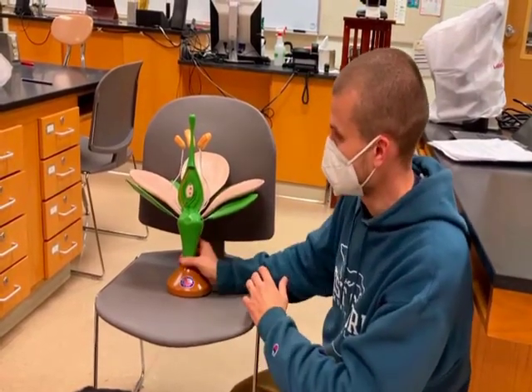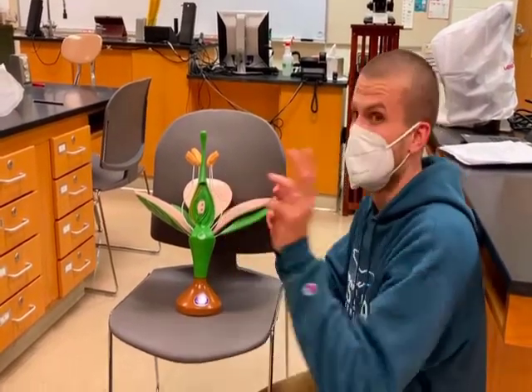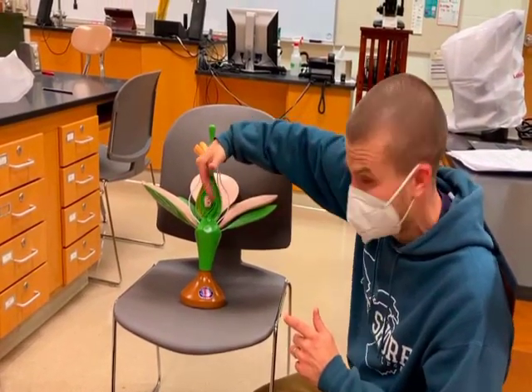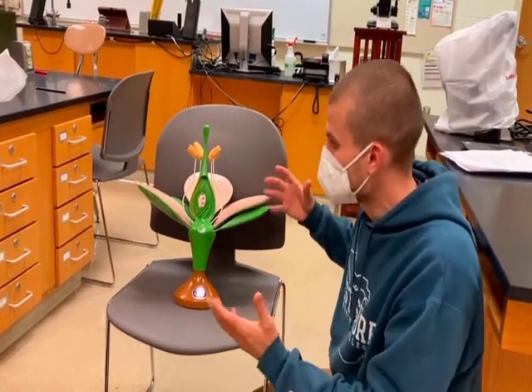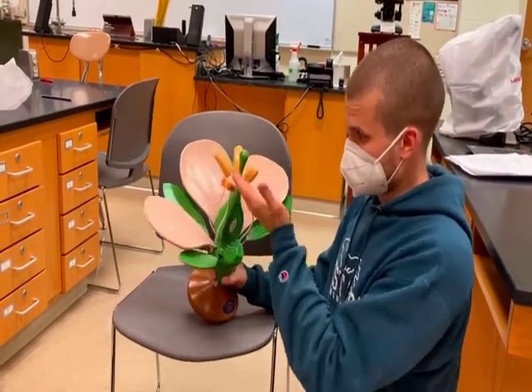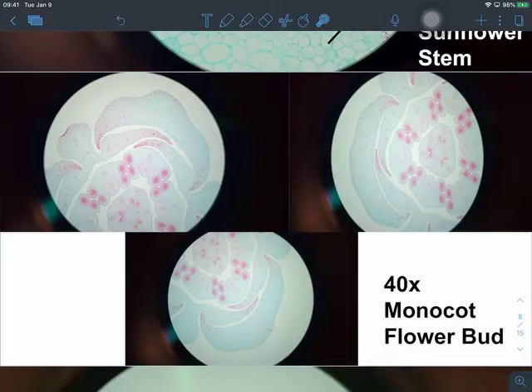And so hopefully that gives you an idea of the complexity of a flower. Yes, everything derives from a leaf, and this is a 4-layered leaf where you've got sepals, petals, male, female. But all of this works in unison to help attract pollinators, spread genetic diversity, and create fruits. All right, so now that you know the parts of a basic flower, the different whorls, let's go ahead and see if we can find differences in the patterns behind how these whorls are constructed between monocots and dicots.